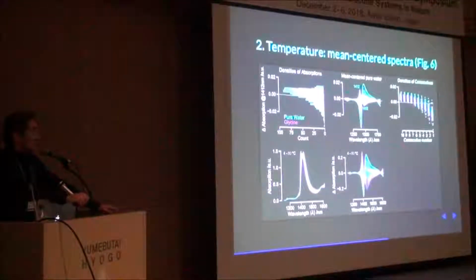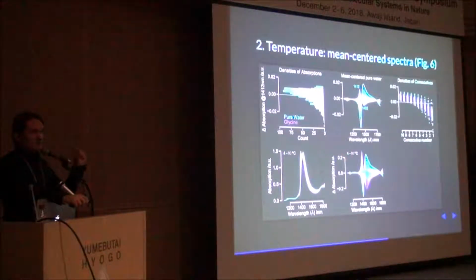So in order to understand this histogram, I took these same spectra, except I did something different. I'm looking at the absorption at 1412, but I'm taking each spectrum and marking, because for every sample I took 10 consecutive spectra, which consecutive number that precise spectrum is.